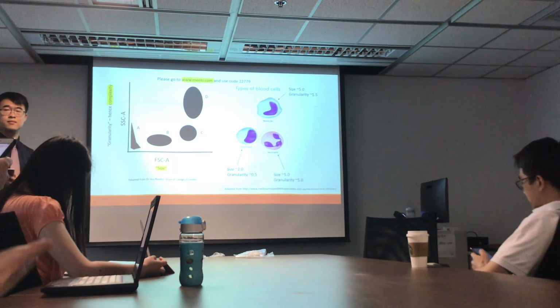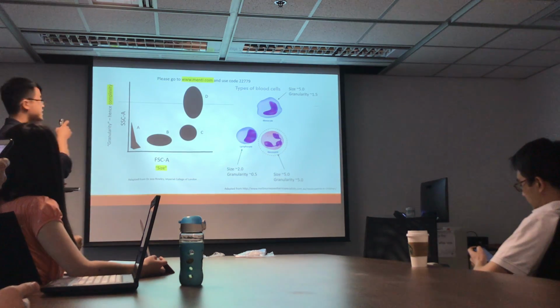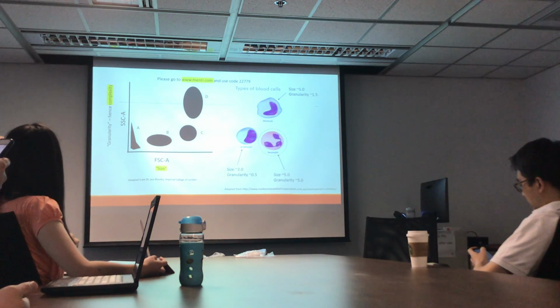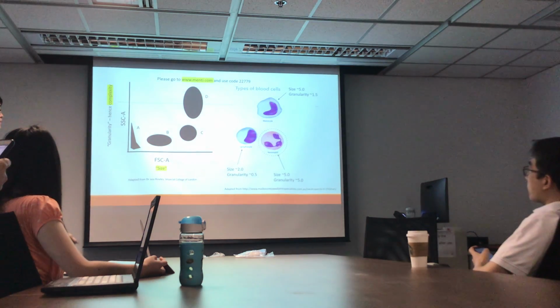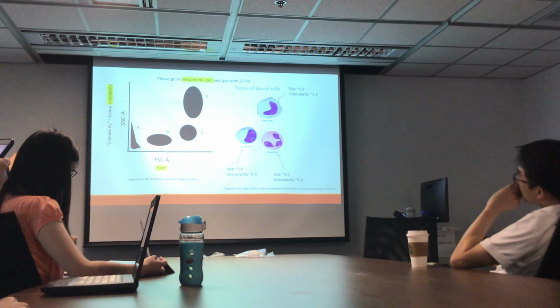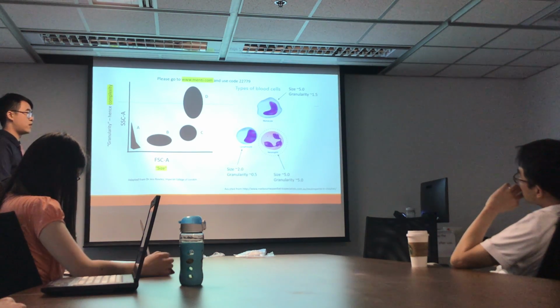So what is SSC and FSC? Oh yes, SSC is side scattering and FSC is forward scattering. So as I wrote here, forward scattering tells us about the size, and side scattering tells us about the complexity, which I gave in the arbitrary values that I've made.